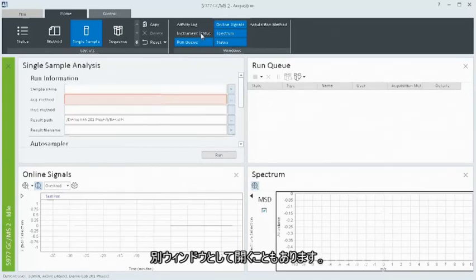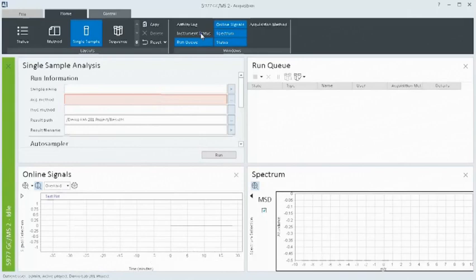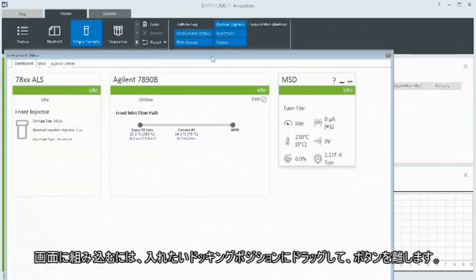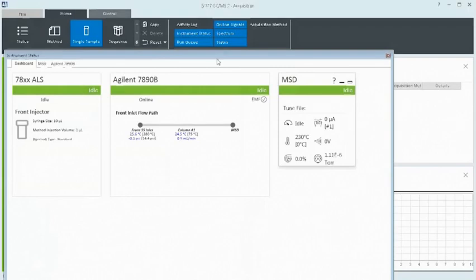Sometimes, a window may open as a floating window. To dock a floating window, drag it to the docking position you prefer and release the mouse button.